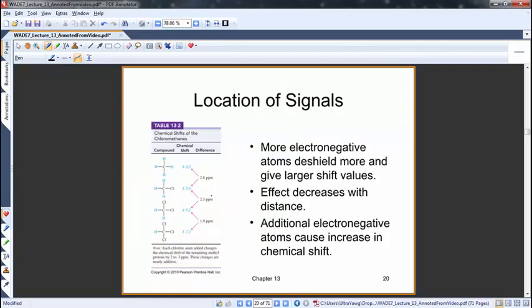There's just some common chemical shifts for things, right? As I start to put more and more electronegative elements on the molecule, the hydrogen gets more and more deshielded. So what happens to the value of the chemical shift? It goes from being very low, essentially zero because it's the same as tetramethylsilane, to more and more deshielded, and this is confusingly written backwards because, you know, that's how we do things, right? Meaning to the left, downfield, deshielded, larger delta values.